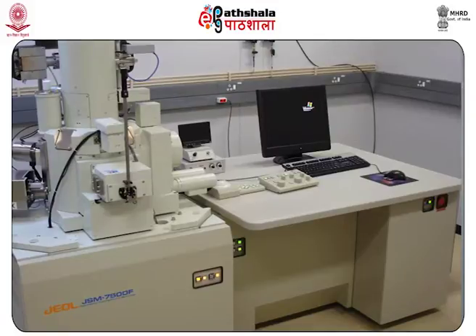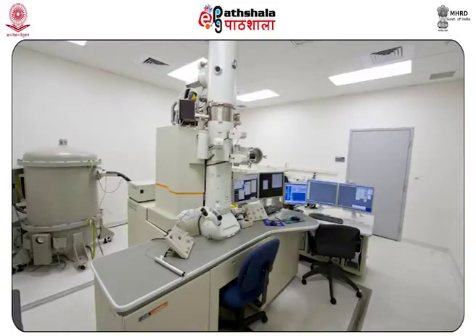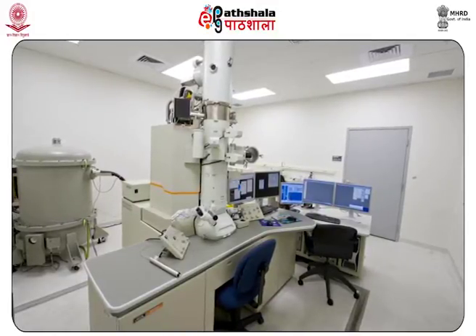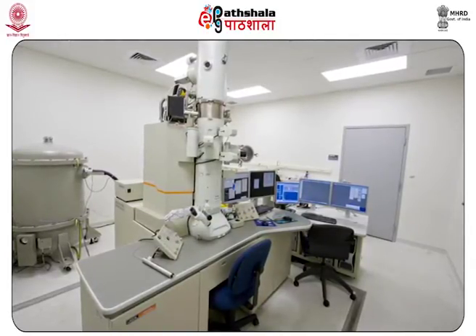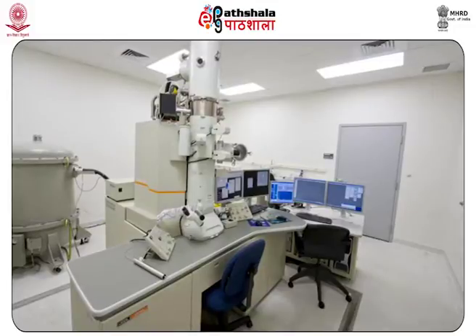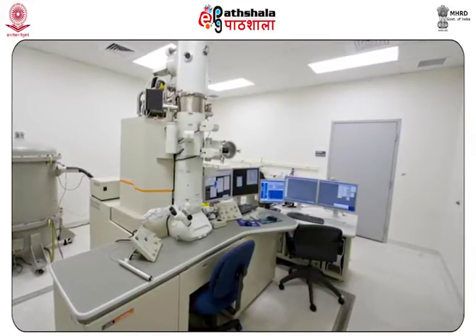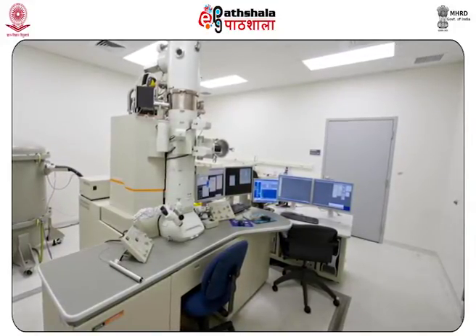The control is infinitely finer over here. And because electrons behave like waves of much smaller wavelength, it has resulted in much more magnification, higher resolution, and greater depth of focus. Now, magnification in a scanning electron microscope can be controlled over a range of up to 6 orders of magnitude, from about 10 to 2 times 10 to the power 5 times.